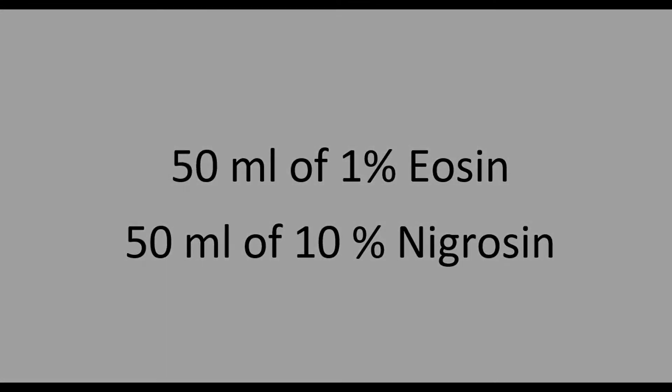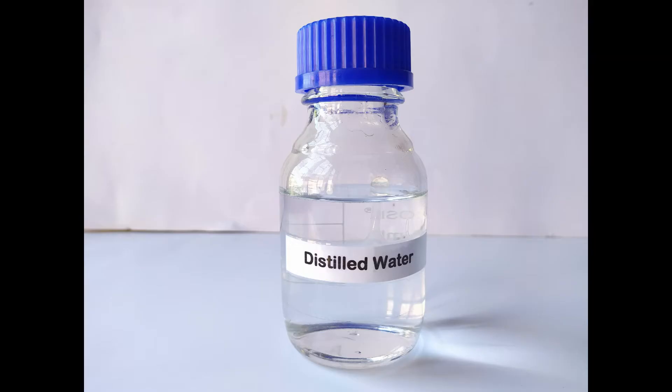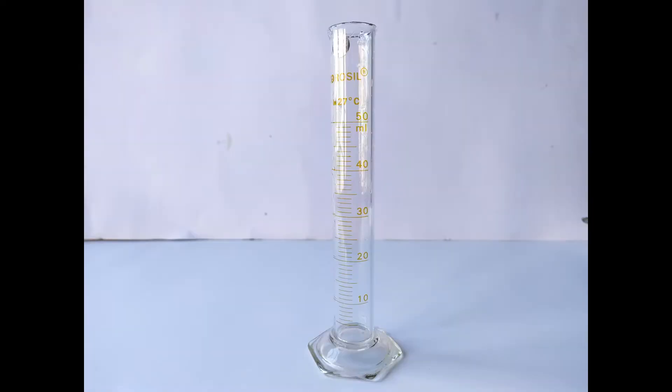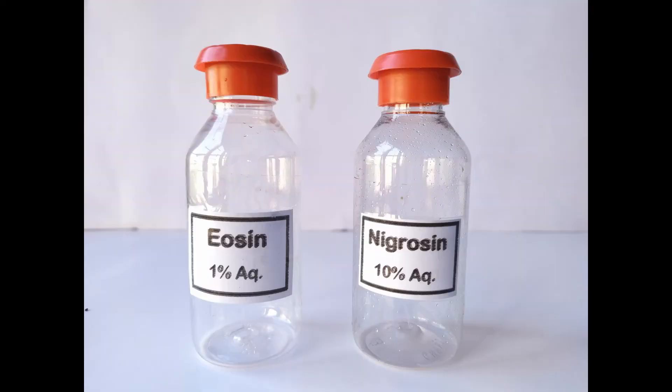To prepare the stain solutions, we'll require the following: water-soluble eosin stain powder, water-soluble nigrosin stain powder, distilled water, two beakers of 100 mils capacity, a 50 ml measuring cylinder, weighing scale, stirring rods, glass funnels, and two containers with tight fitting caps for storing the prepared stain solutions.